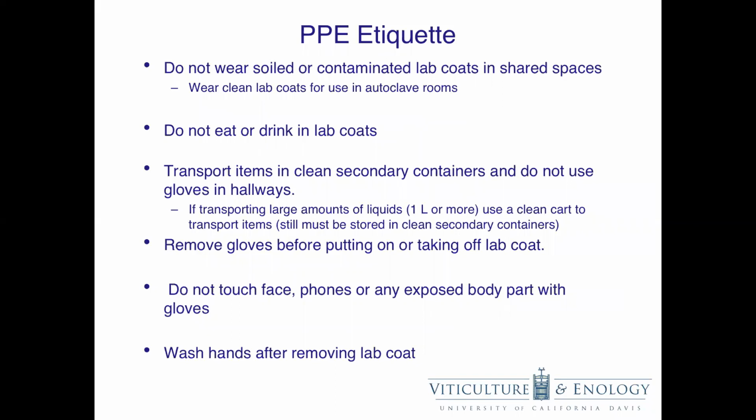If you are transporting something to a different location in the building, your items must be stored in clean secondary containers. Do not use gloves in hallways. If you are transporting large amounts of liquids, use a clean cart to transport your items to avoid dropping and spilling. These items must still be contained in a secondary containment.